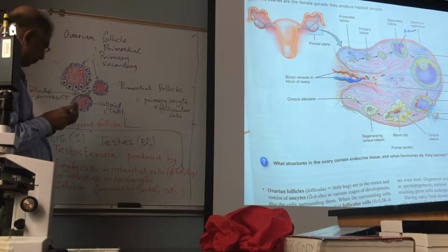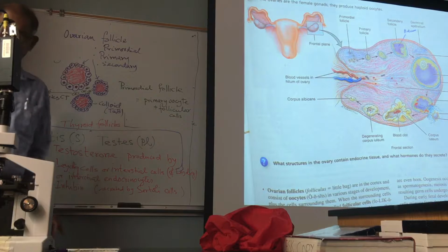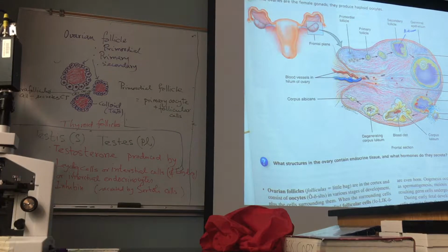I will show you the details under the microscope.